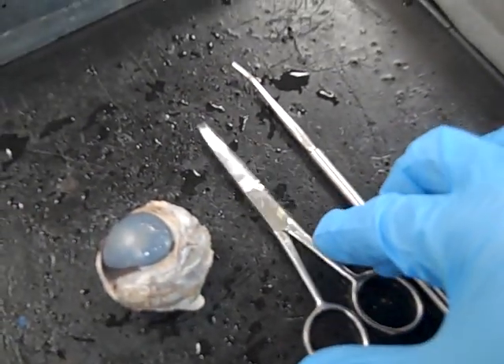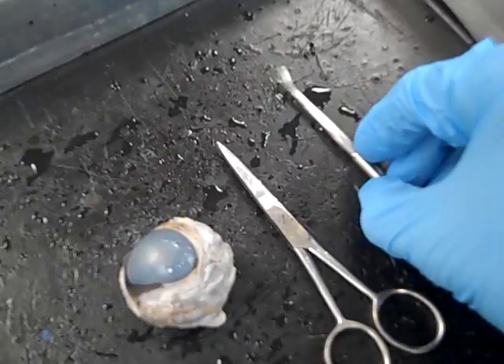First I want to show you the tools we'll be using: dissection scissors and a blunt probe. That's all you'll need.